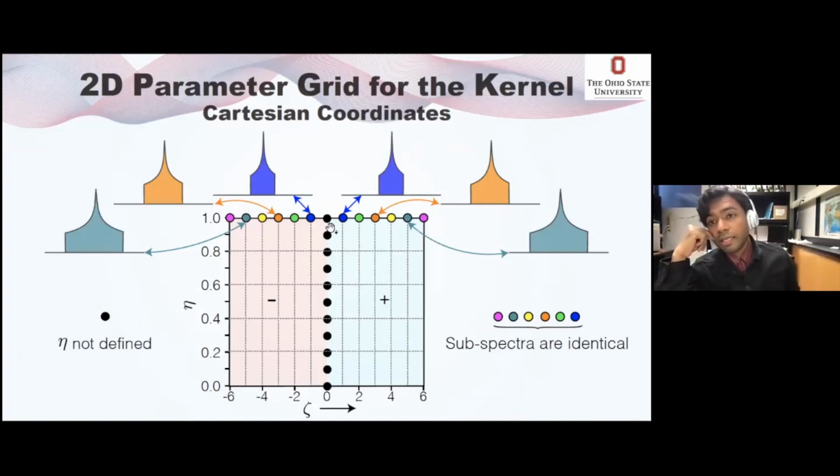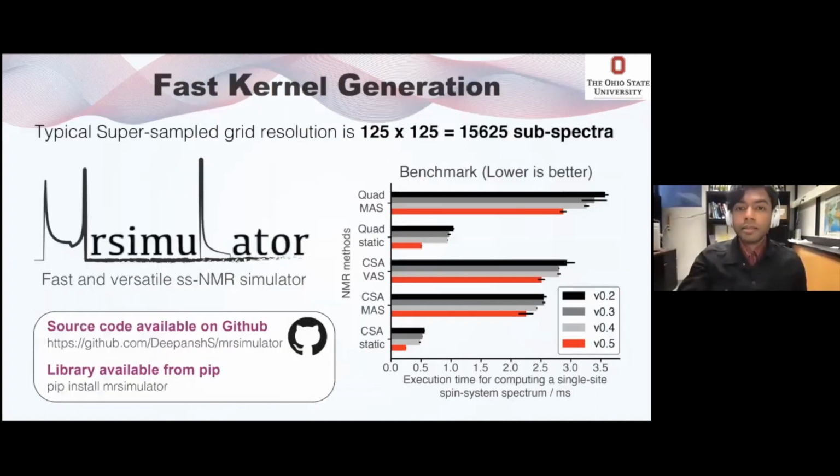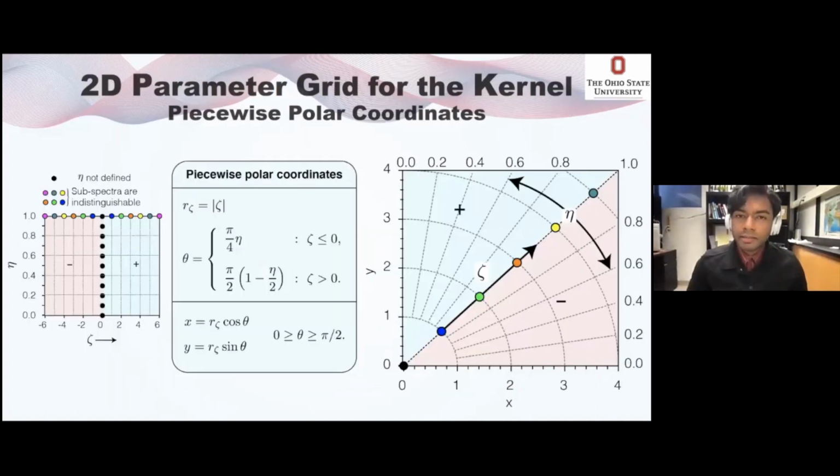And that's true for any approach, even if you're using a least squares fit. What we are doing in this method is taking those two points that are identical and having them share the same coordinate system, so that in the inversion problem we create a kernel that has a higher rank. The more rank deficient the kernel is, the more uncertain the solution becomes. I think that's all of it.